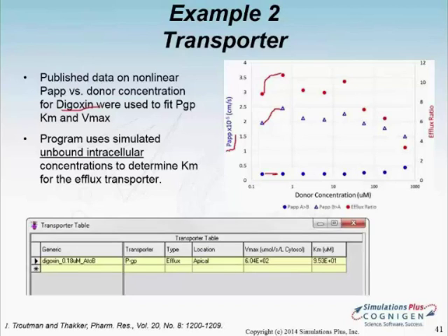molecules. We are still checking on what the actual mechanism is, whether the membrane has a slightly different composition that makes the charged molecules less permeable than a cellular membrane, but from what we have observed, the high concentration gradient of the charged molecule inside the lysosomes would actually push those out quite a bit more, and we were not able to achieve as high a lysosomal trapping effect as was observed.